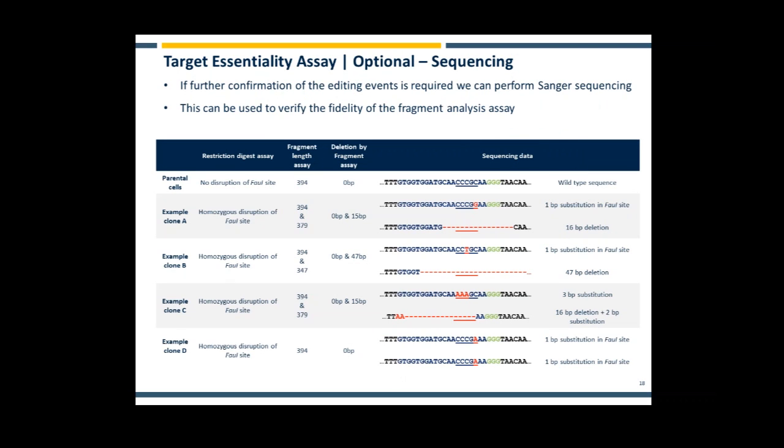So we can also sequence the PCR products by Sanger sequencing. To do this method, the best data is obtained from cell lines with lower gene copy numbers. For higher copy number genes, we could obtain the data by topocloning of the alleles, where we can sequence each allele independently.